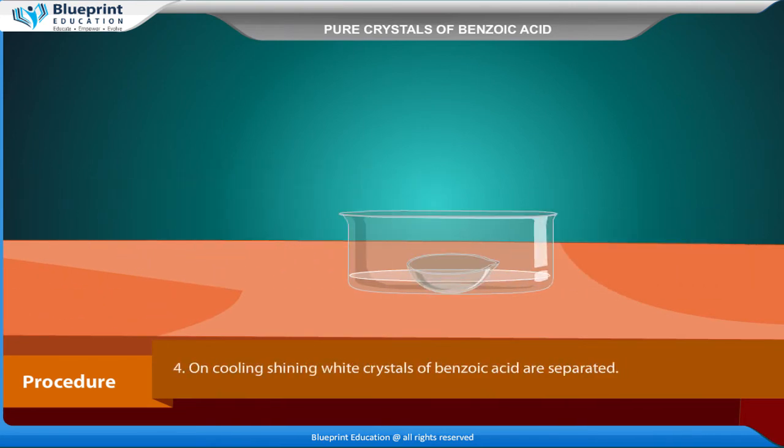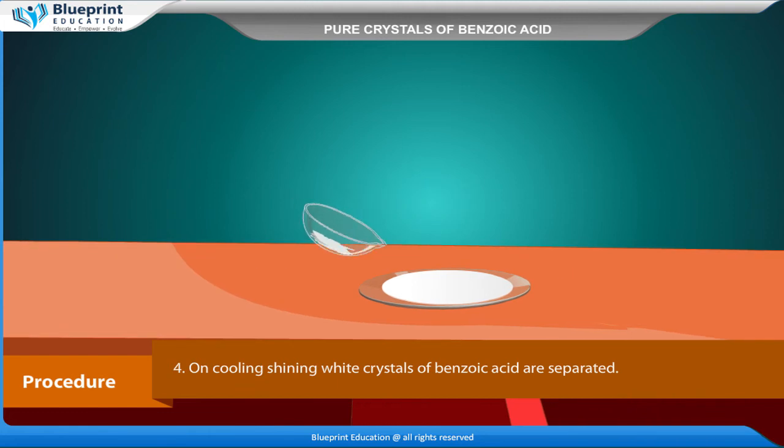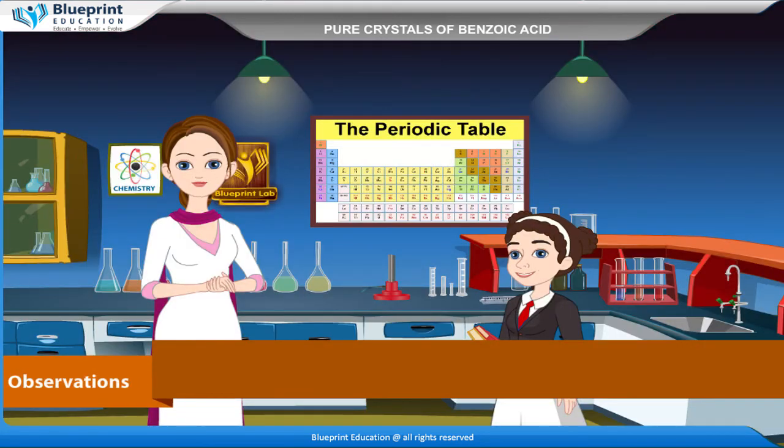Cool the collected filtrate in a water bath. On cooling, shining white crystals of benzoic acid are separated.